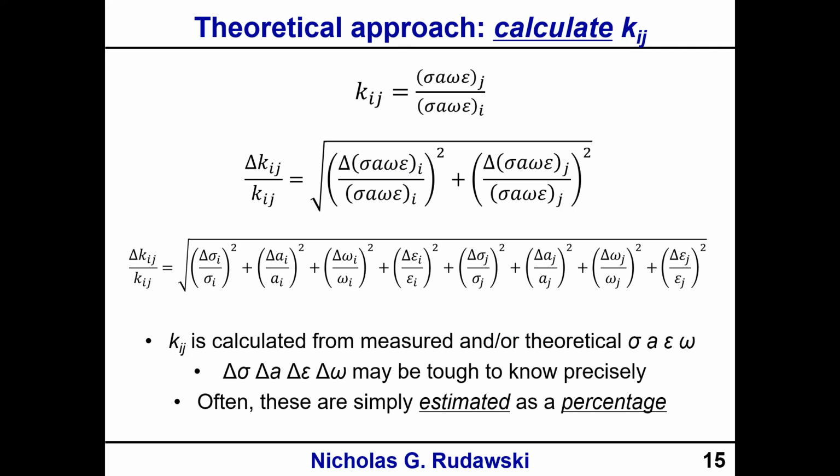So this is what we often do here: we make some educated guesses for the relative errors, right? We say maybe like 5 to 10%. But one of the issues with this is that because some of these values are theoretical, we have to do some estimating here, okay?